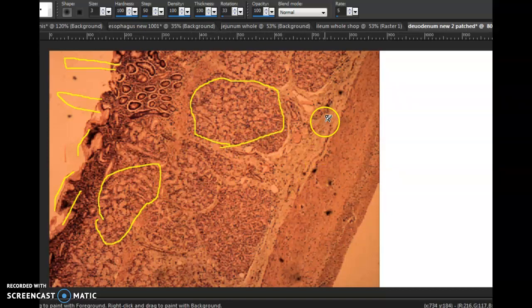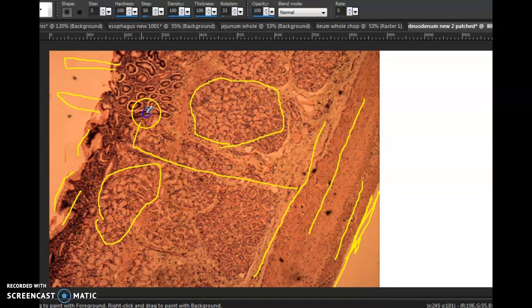And then we have our submucosa right there. Then guess what's next? That's right, we have our circular muscularis. Then what? Our longitudinal muscularis, and then can't really see the serosa, which would be right there on the outside. On this one, I think I only wanted you to do the mucosa, the Brunner's glands, and the submucosa. So there's a humongous submucosa, by the way. And the circular muscle layer. So I'm going to go nice and less layers as we move on.